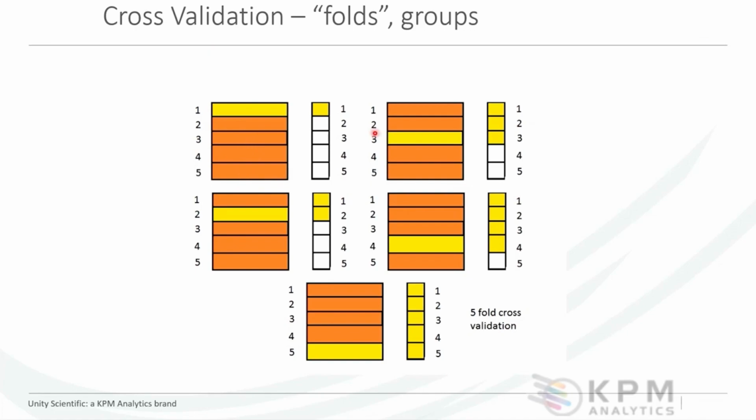Okay, this would be the first iteration in cross-validation. Then there would be a frame shift, and the sample in the 2nd position would be picked, the sample in the 7th position, the sample in the 12th position, and so on. The remaining samples would be used for the calibration set. Again, you do a validation.